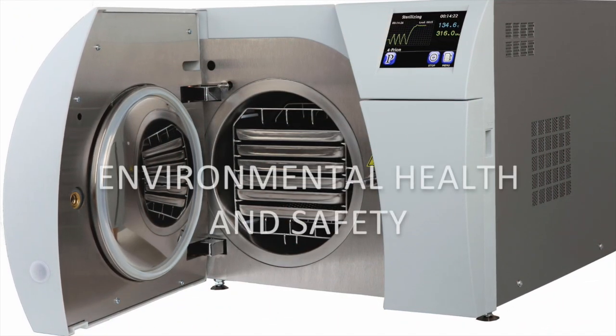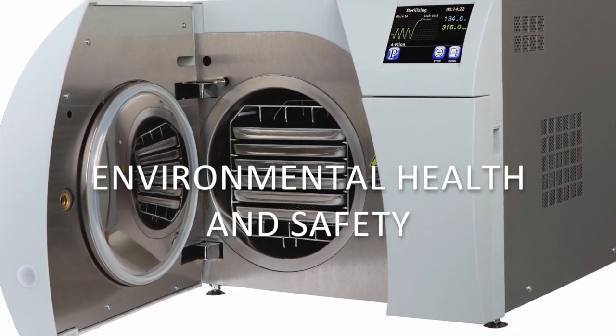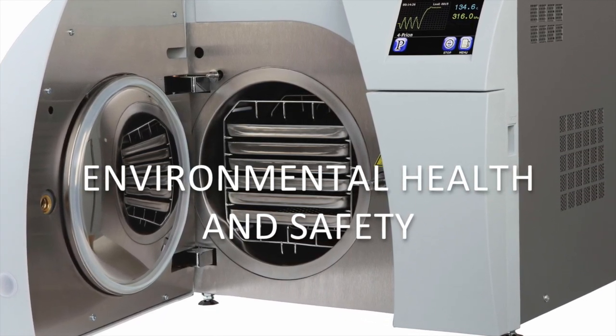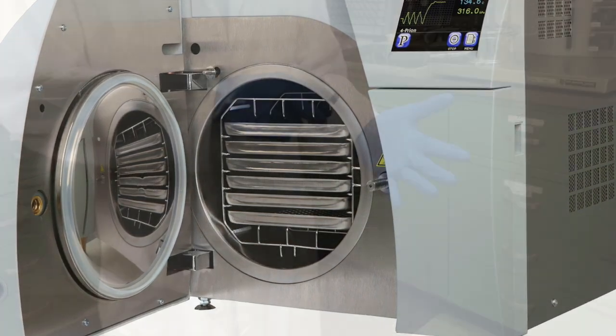E. coli is a highly toxic biologically active material. It is important to have a sterile environment in order to prevent contamination and contact. An autoclave was used to sterilize equipment and glassware before use. Biological materials should be handled under a fume hood when possible.